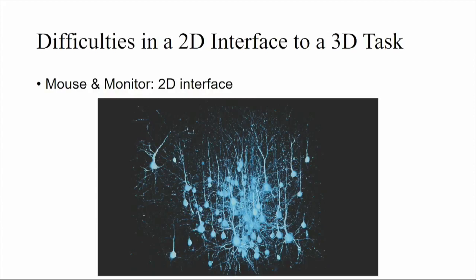Even with a volume rendering tool, which has been added in some other neuroscience tools recently, it still is difficult to perform what is essentially a 3D task through a 2D interface using a mouse. When you click on a screen pixel, a ray is sent through the scene, and at some point it hits some voxel data that is maybe opaque enough to trigger as a click on the voxel, or maybe it's not. And so you end up with a difficult system to work with.